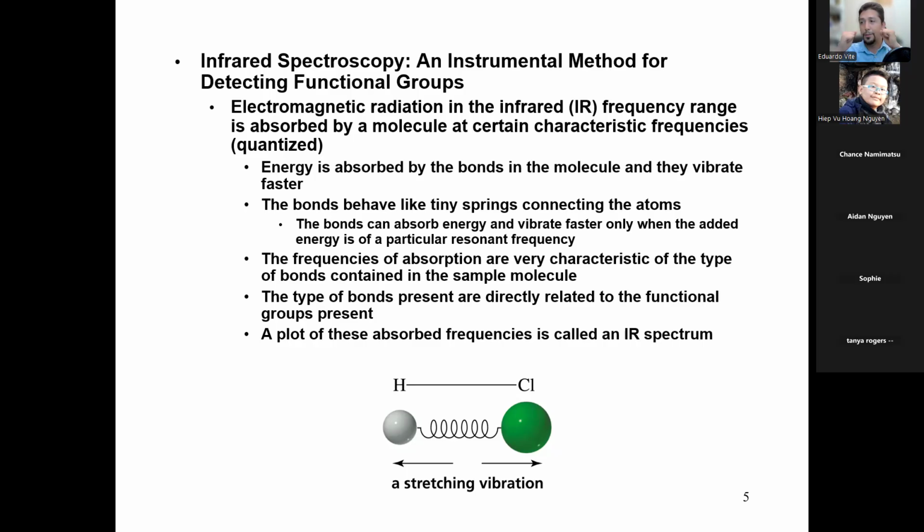And so imagine if you have the same atom, right? Carbon and a carbon bonded together in a spring. Well, the masses are pretty much the same. Well, imagine the masses are different, like carbon and hydrogen or oxygen and hydrogen. The masses are different, so one side is going to vibrate more than the other. All of these have very specific frequencies. They're very specific, they're very unique.